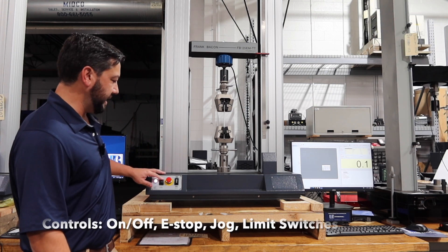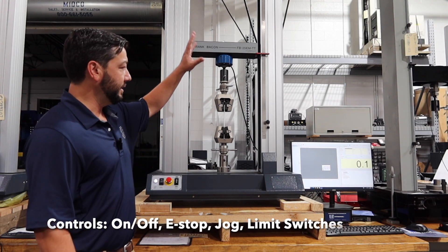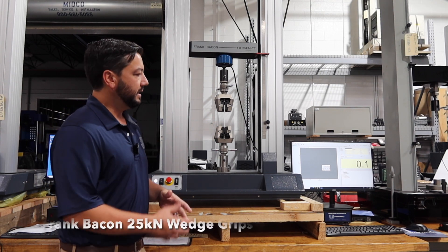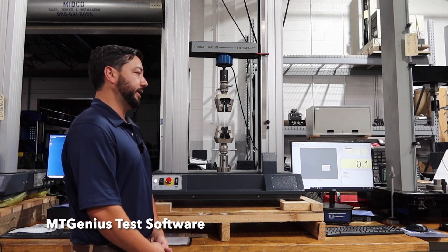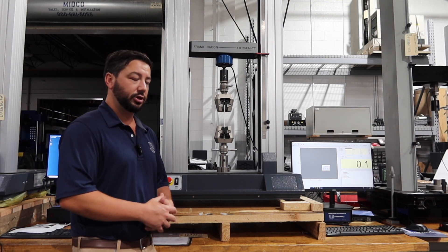It comes with very easy to use controls — on, off, e-stop, and jog — on the frame itself. It has limit switches, and in this case we've got wedge grips on there to hold the specimen for testing. It comes with our MTGenius software for control, data acquisition, and reporting, so it's a complete turnkey system for whatever application you're doing.